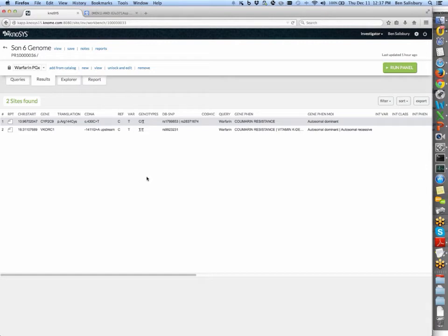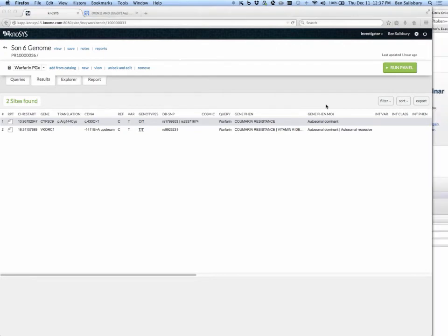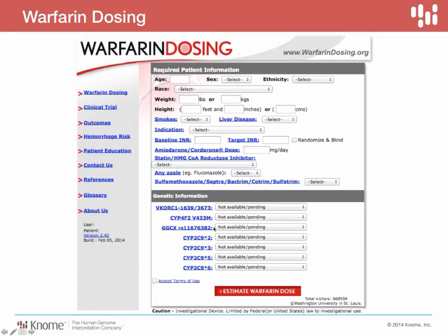There is another approach, which is to create what we call an always call list, so that when a project is annotated, it will go back to those block records in a GVCF, if you have that provided, and pull out those reference matching genotypes at the other positions. But here we could export these, but right now I'm just going to keep them in memory, and we go back to our slideshow. And what we would do is simply fill in those appropriate variants for the VKORC1, CYP2C9 star 2, and fill in the others as wild type, which is what I've done here.